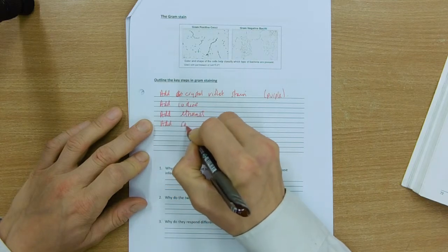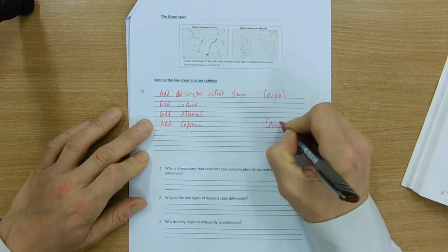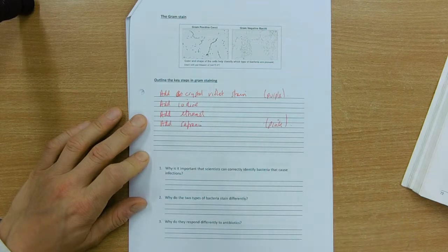Add safranin, and that is pink. So those are the key steps.